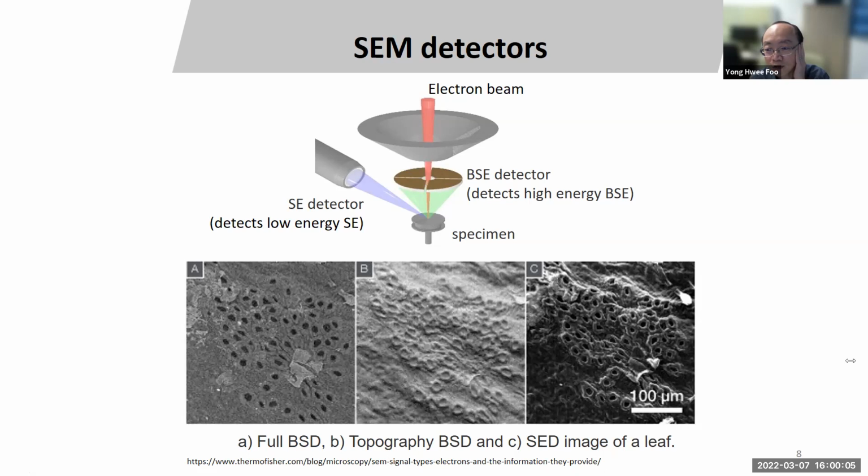As long as the sample is not very wet, you can basically just stick it under the electron microscope and generate an image. There might be samples that we haven't imaged before and we probably need to optimize, for example, the energy of the electron or the vacuum pressure settings. But by and large, if you wish to use it, you can just contact us and describe a bit about the samples and we can take it from there. Yeah, thank you, Isaac.